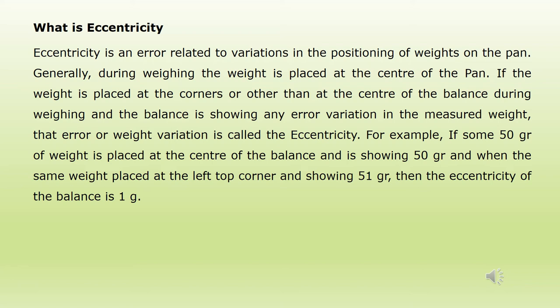Generally during weighing, the weight is placed at the center of the pan. If the weight is placed at the corners or anywhere other than the center and the balance shows any variation in the measured weight, that error is called eccentricity. For example, if 50 grams placed at the center shows 50 grams, but the same weight at the left top corner shows 51 grams, then the eccentricity of the balance is 1 gram.